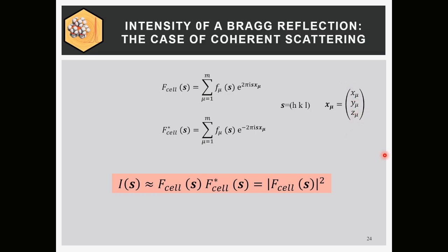And so all of crystallography for more than 100 years has tried to recover this information. This is known as the phase problem in crystallography, which is the same for single crystals and powders. But in single crystals, you have an overdetermined system. You have maybe 2,000 reflections. So there are lots of statistical methods to recover the phases. Once you have the phases, you get the X, Y, Z. In powder, this becomes more complicated.